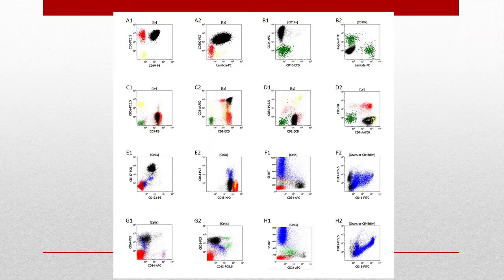F is actually a myelodysplastic bone marrow, type 2 with an increase in blasts. I think there were about 10% blasts in this one. G shows a monocytic leukemia that doesn't express CD34, but does express a little bit of CD13. Not shown here, I think they are CD117 positive.